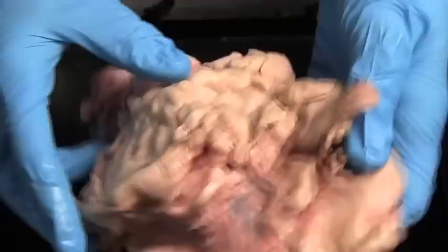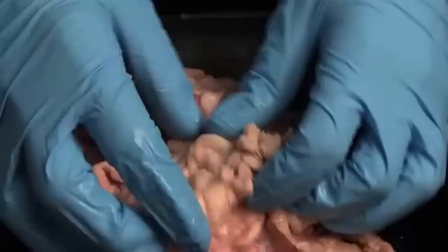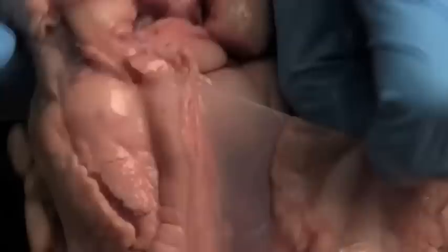When you get your heart, you're going to see it's in the pericardium. The first thing you want to do is look at the pericardium, and you can see there's quite a lot of fat on the pericardium. They were fattening this sheep up, so we're going to have to cut this off of the heart before we can work on the heart itself.